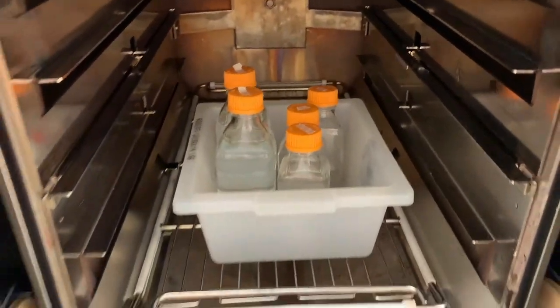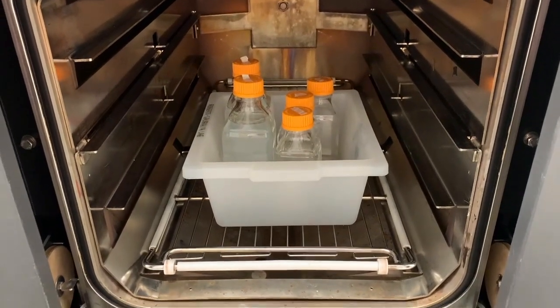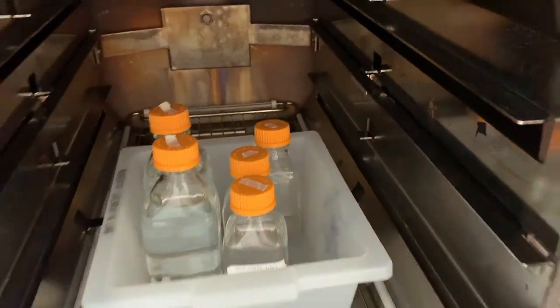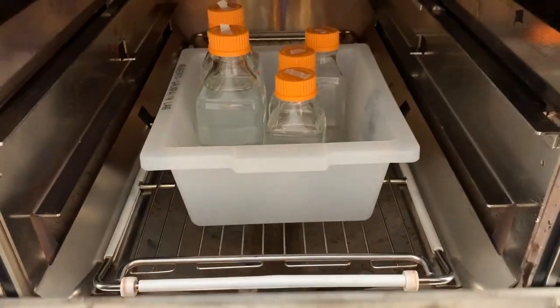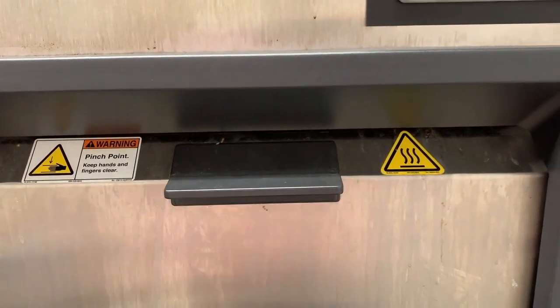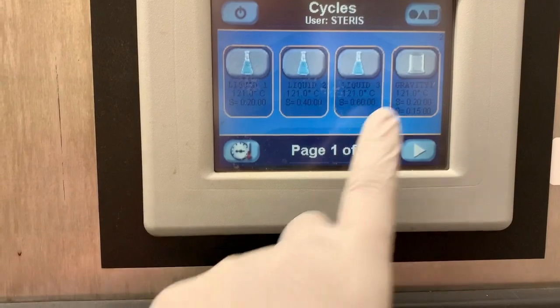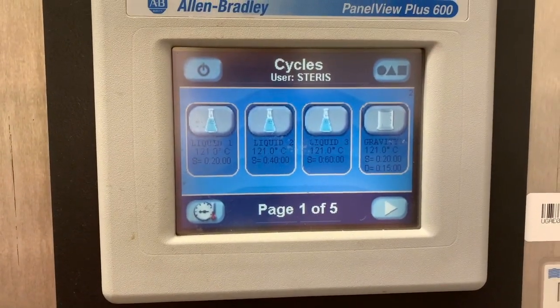This can be very hot, so you want to use those autoclave gloves when you're putting things in and out of the autoclave. After you put in your solutions, and again, make sure your solutions or bottles have their caps slightly ajar, you're going to close the autoclave. And this one you close just by lifting up the door. And then if you go to the menu, it will give you a lot of different choices. So liquid cycles or gravity cycles, which is appropriate for glassware or other things that you want to sterilize.